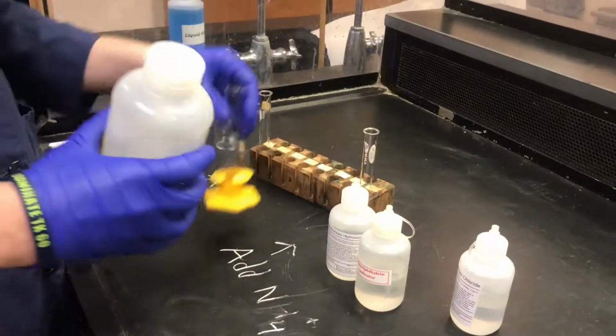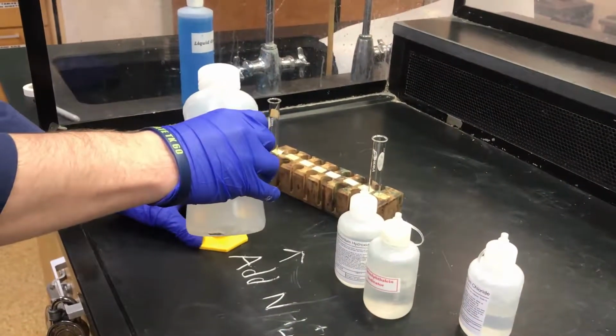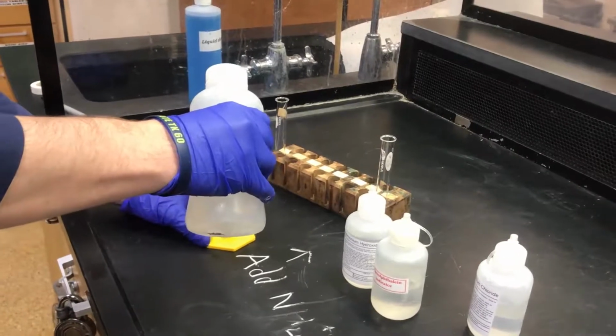So here in part 2, we will be adding 15 mL of DI water to our 50 mL beaker.